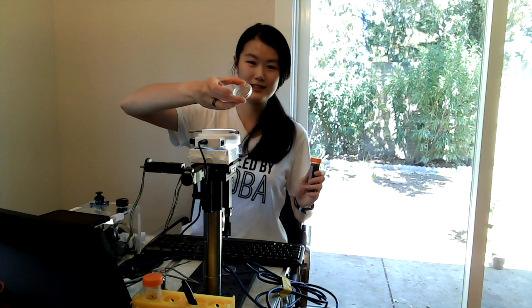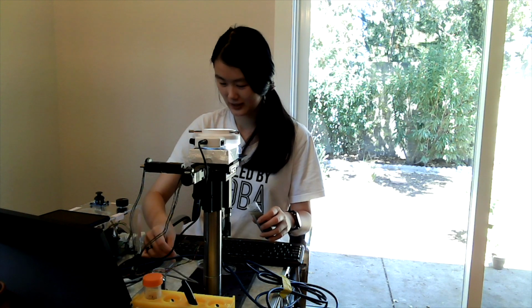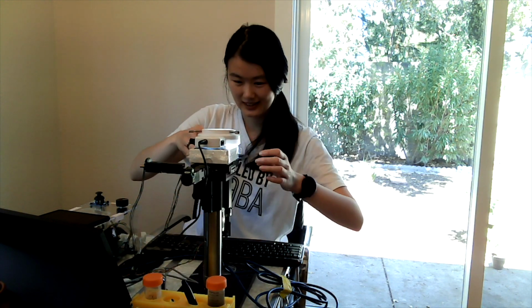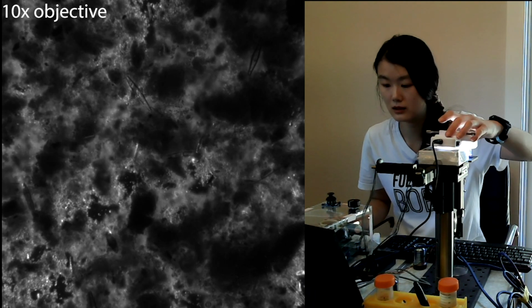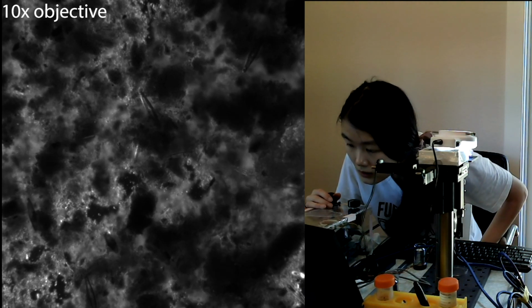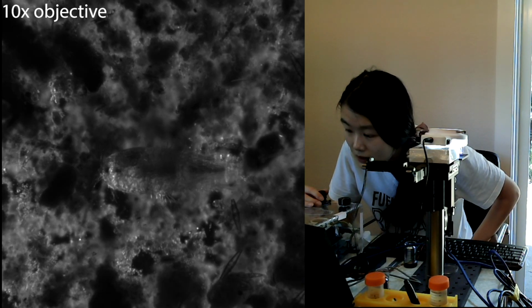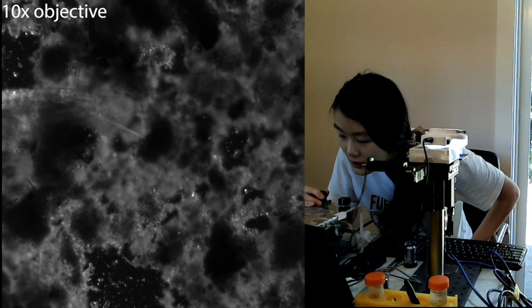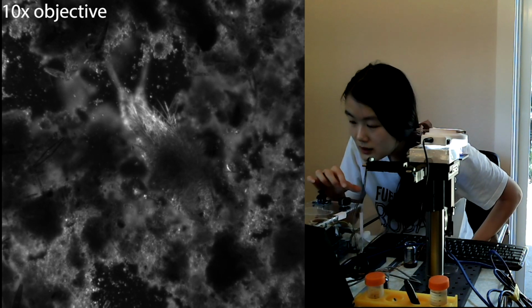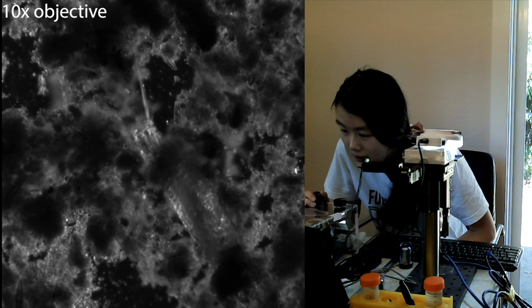We're just gonna take this glass bottom dish and a dropper. Okay, so I put like 4 droppers worth of water. I'm gonna put it on the microscope. Yeah, this sample has a lot of diatoms. Ooh, there's some fast moving thing. Whoa, that's a shrimp! Right? Is that a shrimp? A copepod? Is that a copepod?